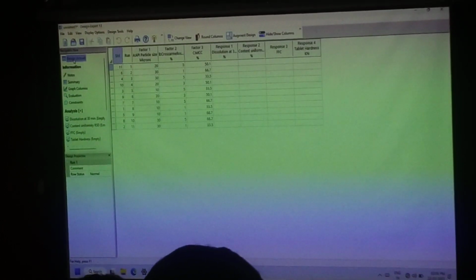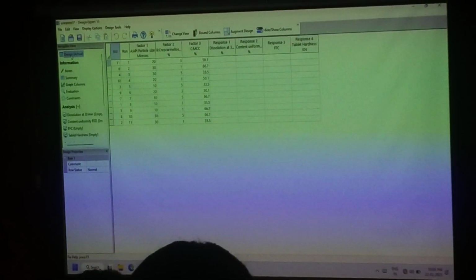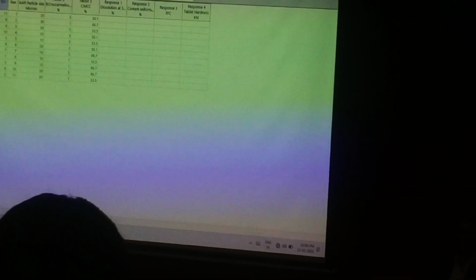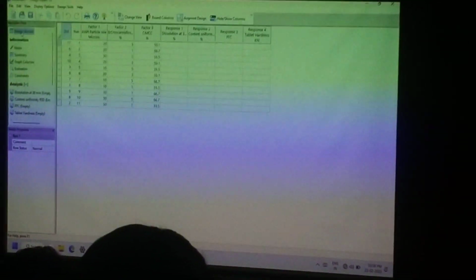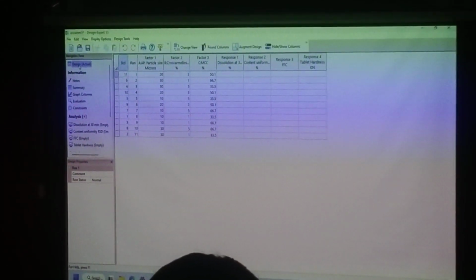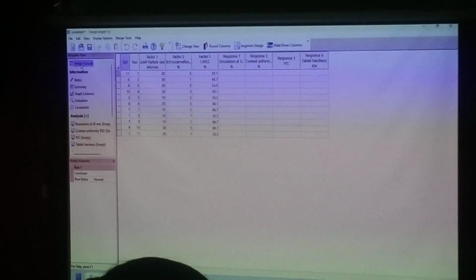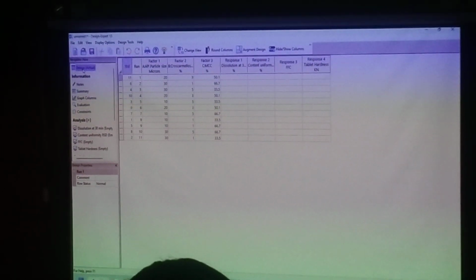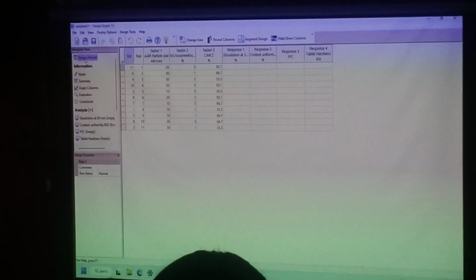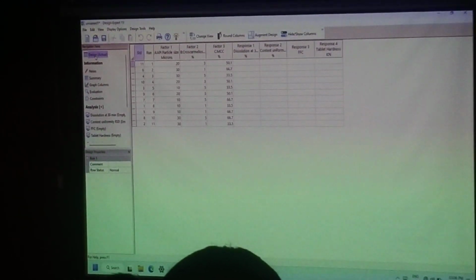We'll go to the design again. We'll go to the lab and conduct all these experiments. Once we manufacture, we test for dissolution, hardness, flow function, and RSD. Already I have given the answers for you. Relevant to that particular design, like 2350.1, go to that answer and check carefully. A slight mistake and the analysis will go wrong. Enter the values of the responses to the respective design only.